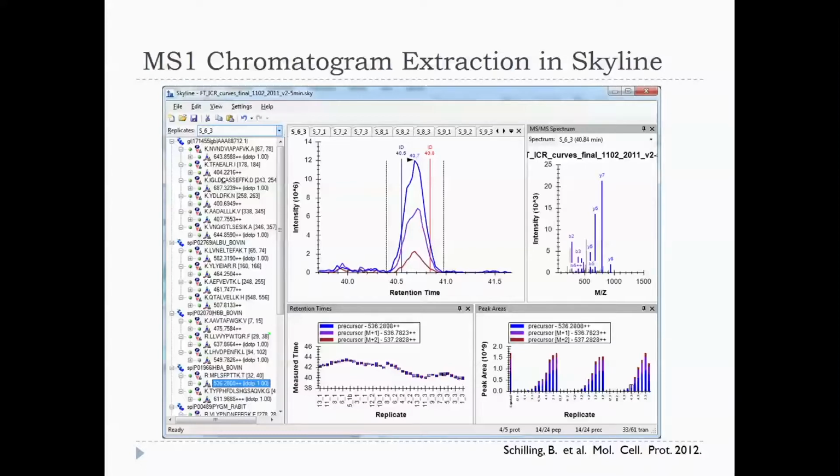And Mike was the one who said, that's not the way to do it. You don't get a realistic understanding of your variance that way, because you just collect everything. If you're saying, wow, I got a CV of 5%, you're underestimating your true CV. And there are actually washes in here that we don't have. But according to Mike, this is a more rigorous way to do a calibration curve.